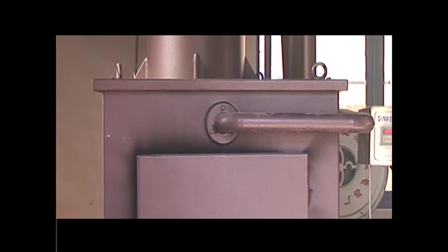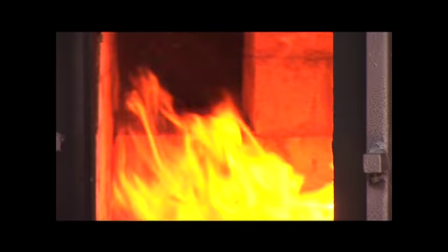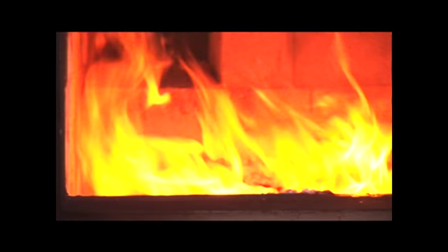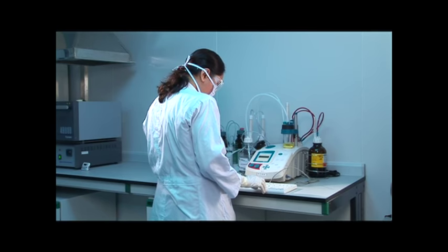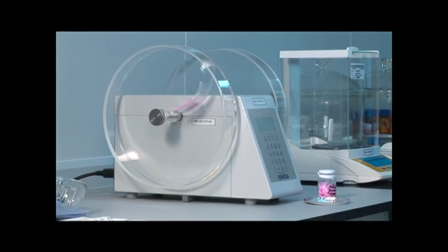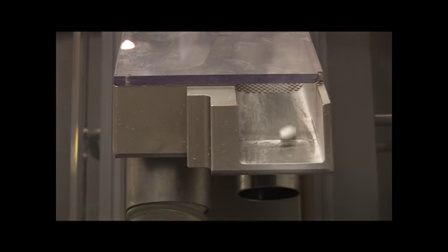Incinerator for burning insoluble solid waste materials introduced for the first time among the pharma industry in Bangladesh. A glance at the client's network spread across the globe can prove to be a strong acknowledgement of the fact that Beacon's products are truly world class.